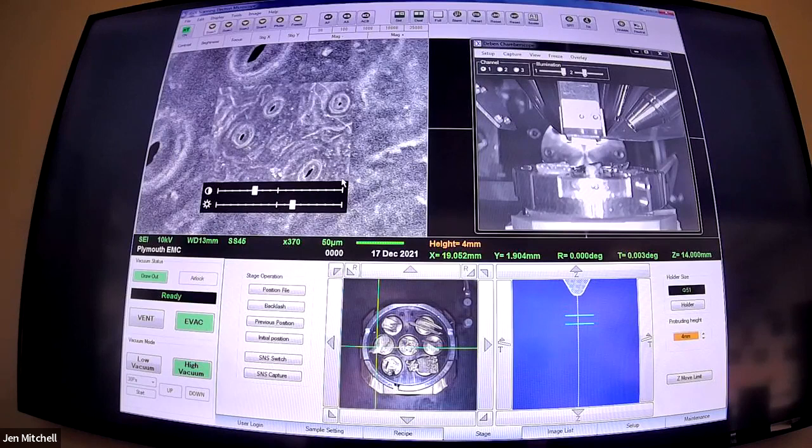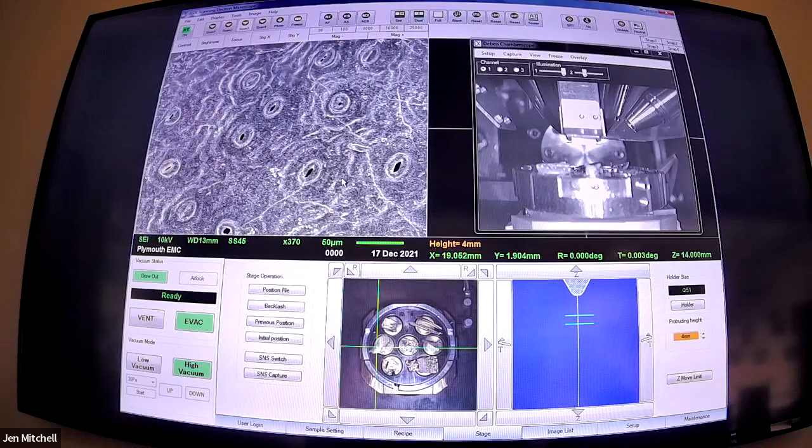On slow scan, this is now the underside of the holly leaf. These are all stomata - so all the stomata there, which is how the plant transpires. You can see the sort of guard cells around, and they do just look a bit like squashed donuts.